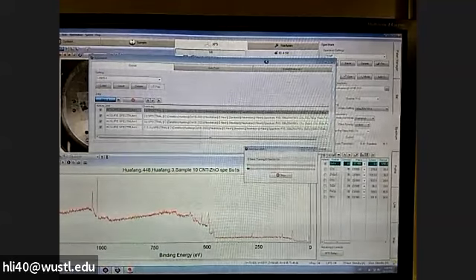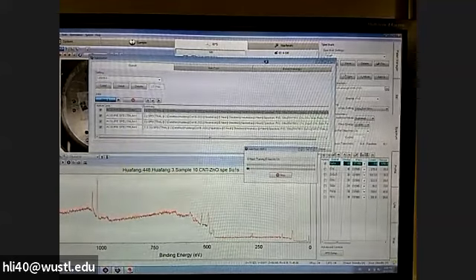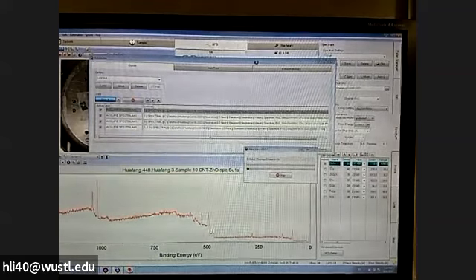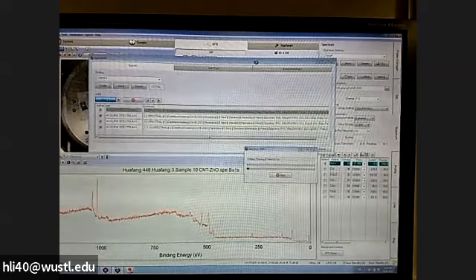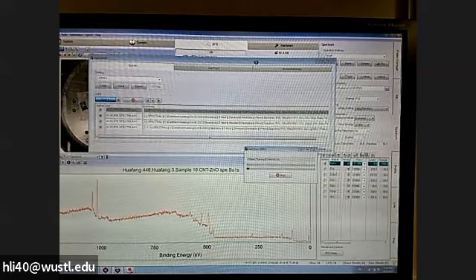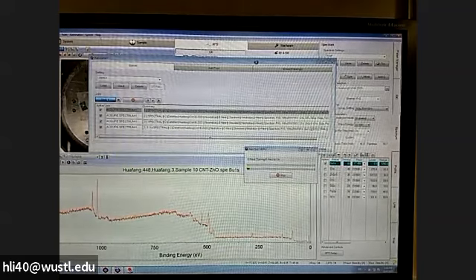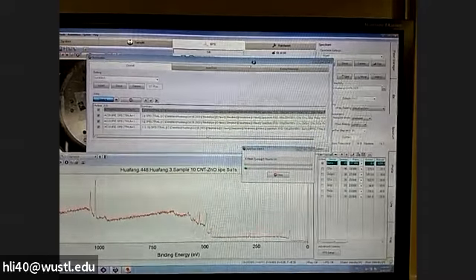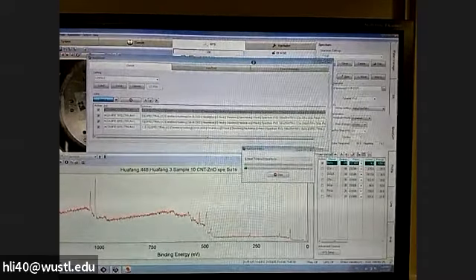We don't mind if you use it after working hours. You just leave the room, let it run, and you get the sample the next day. It's okay. If you only need 2 hours or 3 hours, choose the morning time. All right. We'll see you when it's ready to pick up the sample.